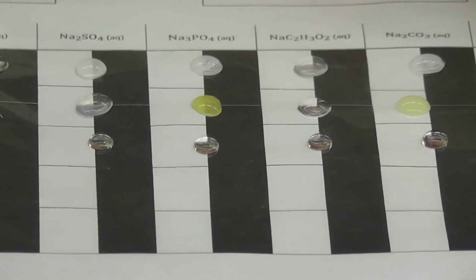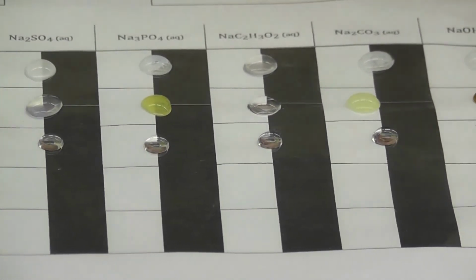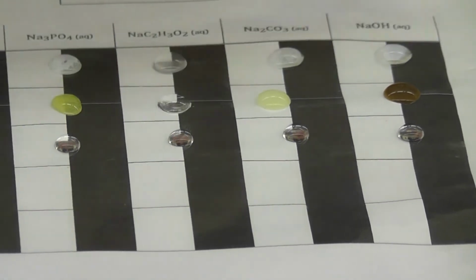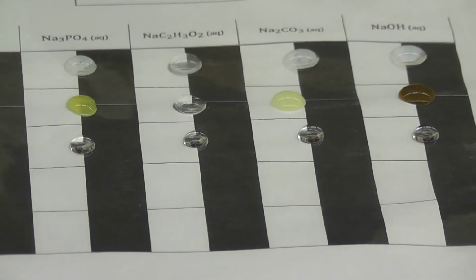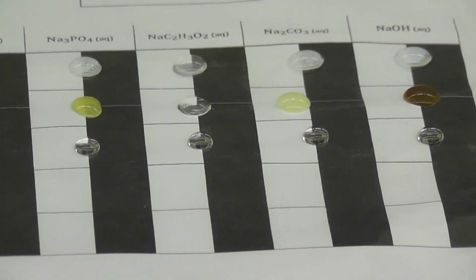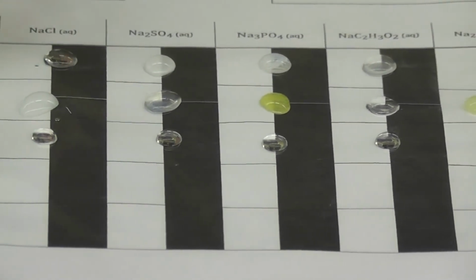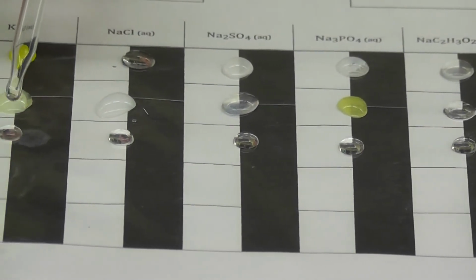Here, and one last one. There we go. Now all we have to do is just match them with the corresponding top liquids. Okay, first one is potassium iodide. 1 drop of that added to the calcium chloride.